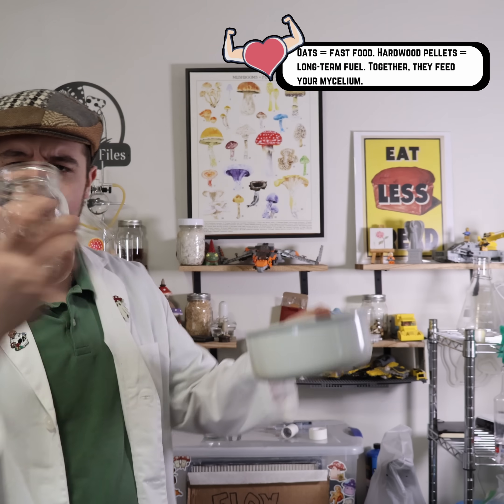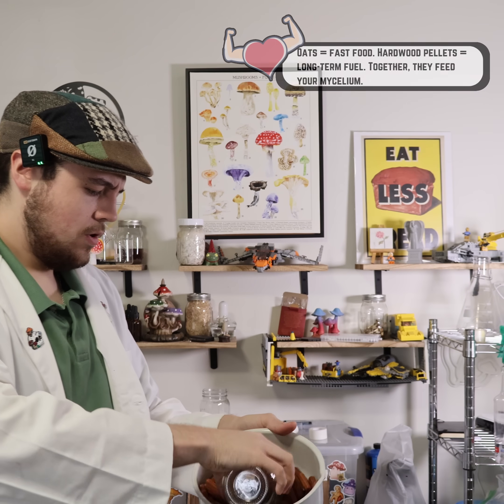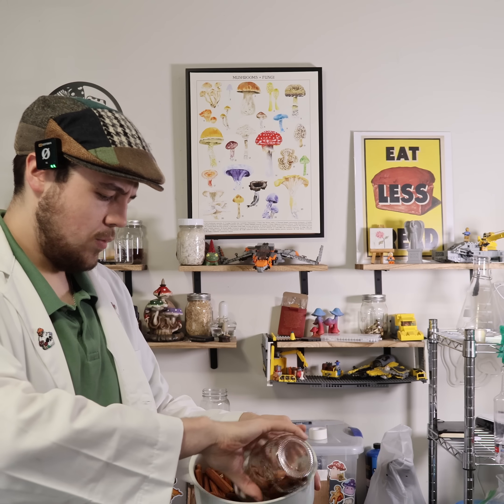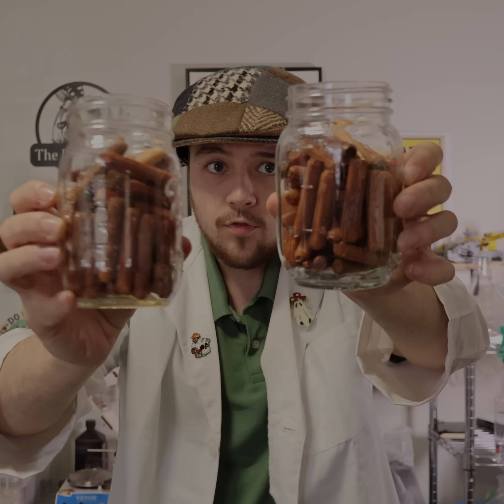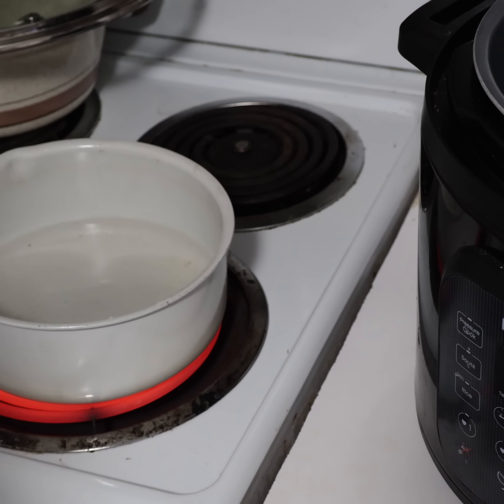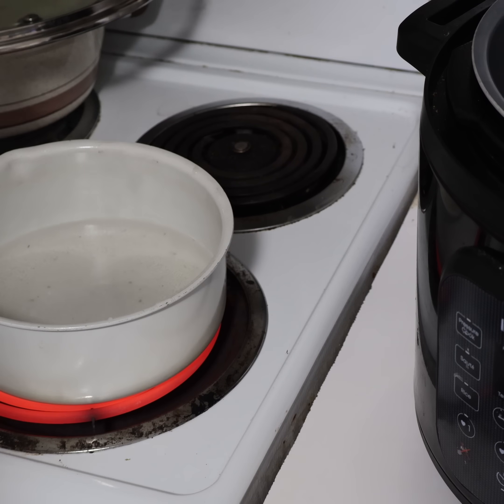Now that we have the dowels ready, it's time to prepare the oats and the hardwood. All I'm going to do is fill both of these mason jars about three quarters of the way full with these hydrated dowels. There's both of the jars full. We're just going to boil a little over a cup of water to soften some oats and then soften some hardwood pellets.